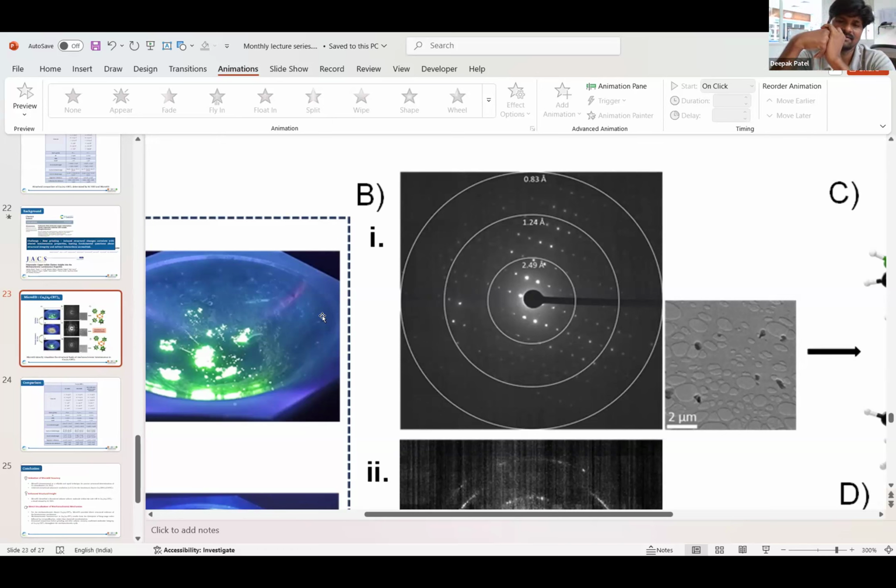Is it not because of the crystal orientation? In single crystal XRD, when the crystal is rotating, based on the detector distance as well as the orientation of the crystal, some spots will be very intense, and the same spot after another orientation will have low intensity. So maybe a similar thing is happening here when you are rotating the stage. Or is it because of changing the planes, the direction of the scattering? In XRD, we notice the same spot in another frame will have lower intensity. The same thing will happen here, I guess. Yes, the same thing will happen, and more.